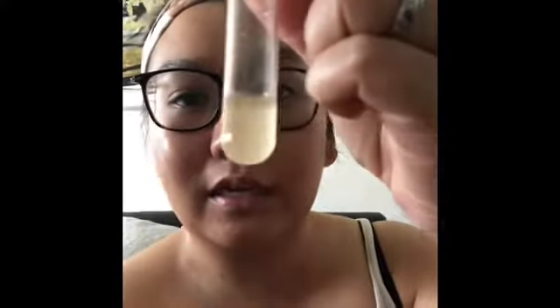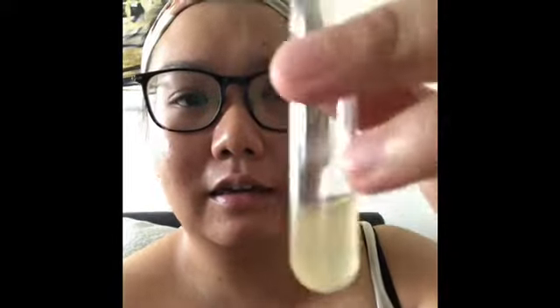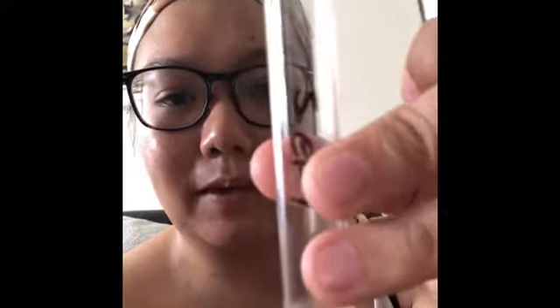After that, we did the VP testing. So I actually have both the tubes here with me. This right here is the E. coli, and this right here is the S-epi. So I actually thought that the S-epi had more of a red film on top. I thought it was going to, because while I was waiting for it to form the 30 minutes, it looked like there was a small tint of red at the top, but after 30 minutes there was no red at all. So I found that pretty interesting.